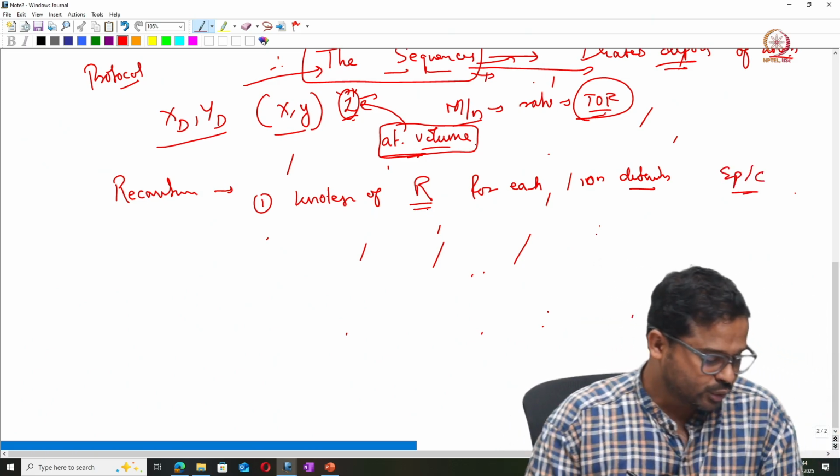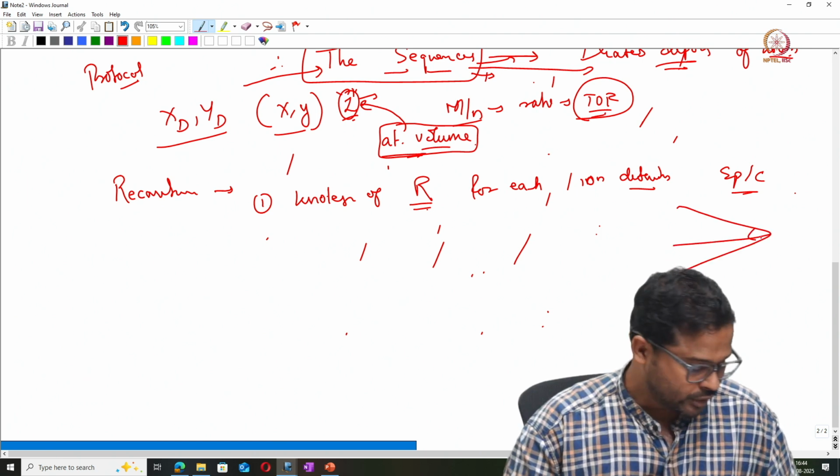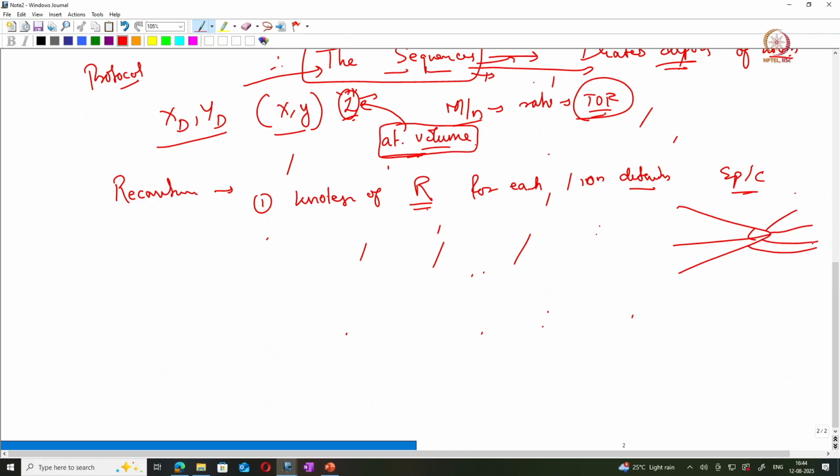You know that the shank angle is not 0. As the atoms get ionized and field evaporated, the specimen gets blunted. Blunted means the radius of curvature increases, or the curvature decreases. Due to this, there is a reduction in the curvature, which means that the electric field also drops.